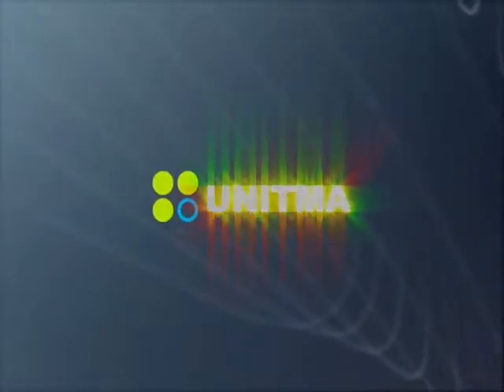This video demonstration is created for your understanding of Unitma's Automated Tissue Microarrayer.